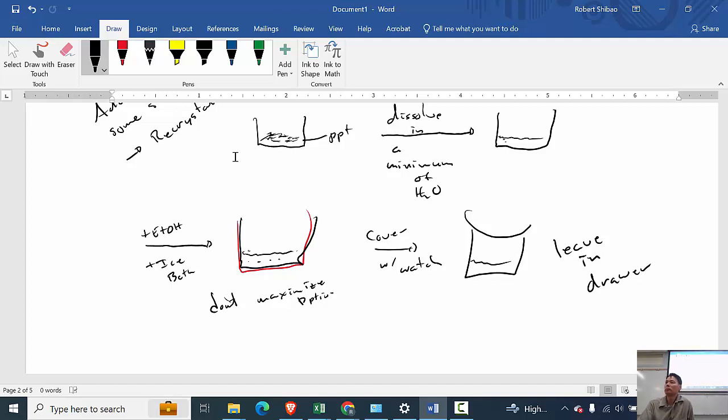In the first precipitation, we want to maximize the amount of precipitate. So we're going to just keep adding ethanol to try to get the max. Cool it in an ice bath. We want rapid precipitation because we don't want to wait all day. In the second precipitation, I want it to precipitate slowly. That is, slow precipitation is what I want, because I want to generate large crystals.